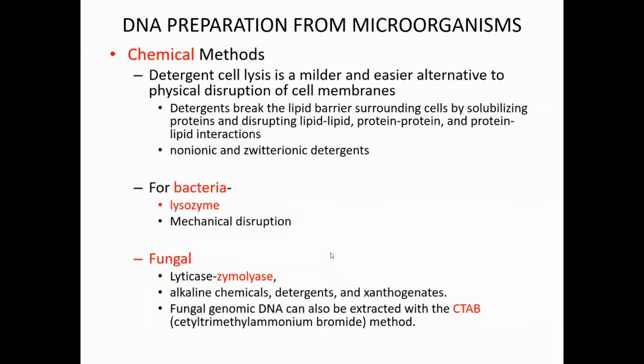And the other method is the physical method. In the physical method, you use physical disruption, like a sonicator. You have a probe to break the cell, or you can use the ultrasonic sonicator. Use the ultrasound to break the cell. That's a physical disruption.